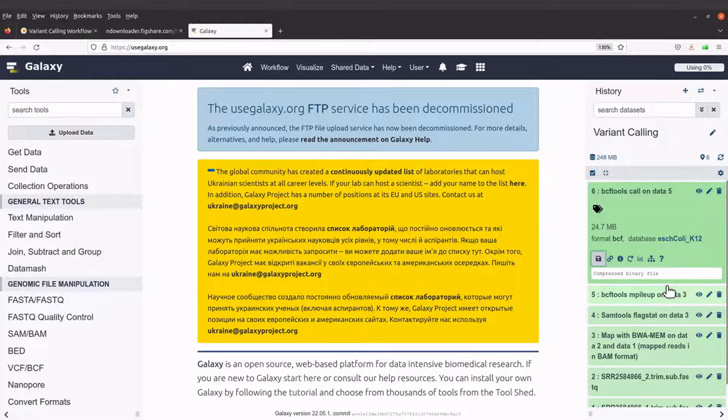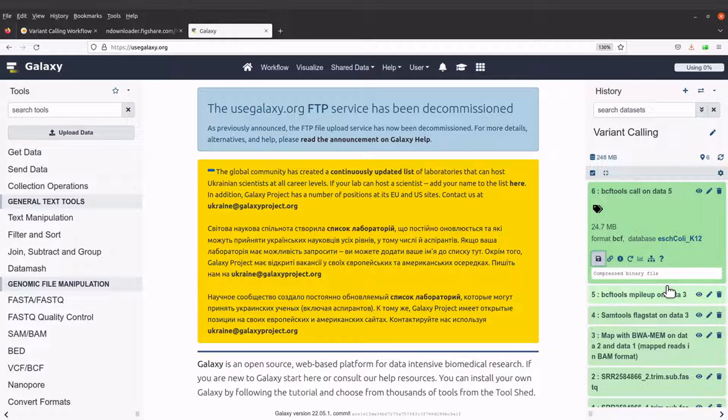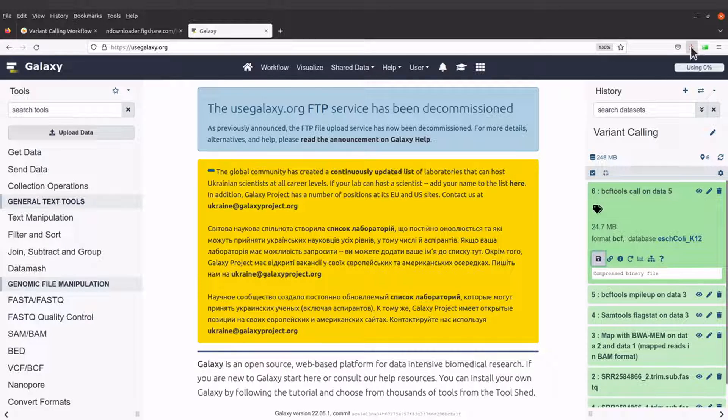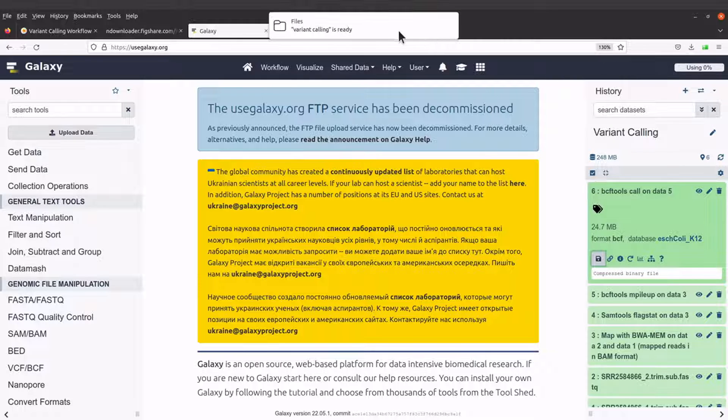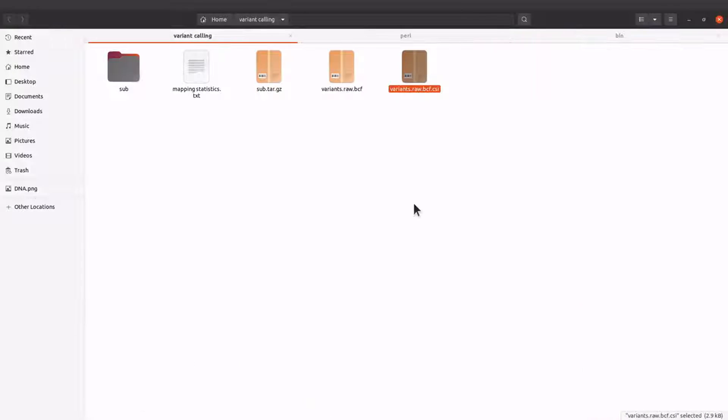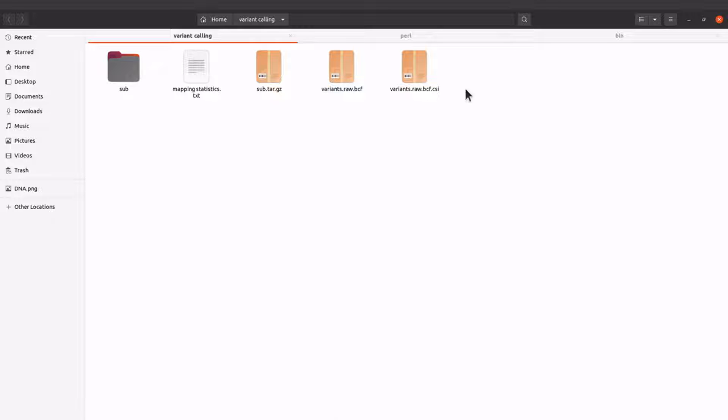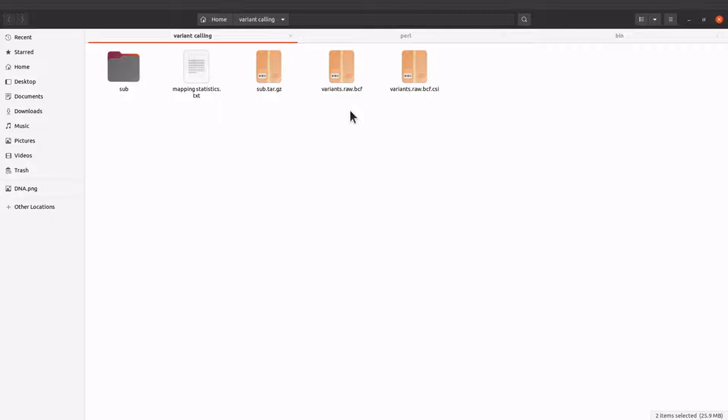Okay, so the files have been downloaded. So let's go and then check them. Okay, so these are the files.